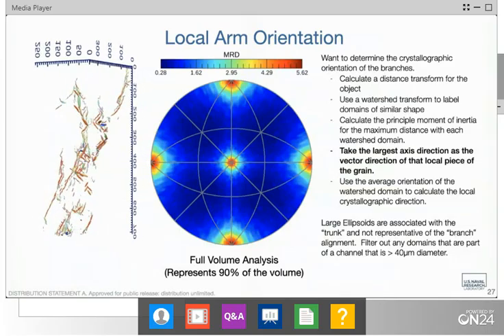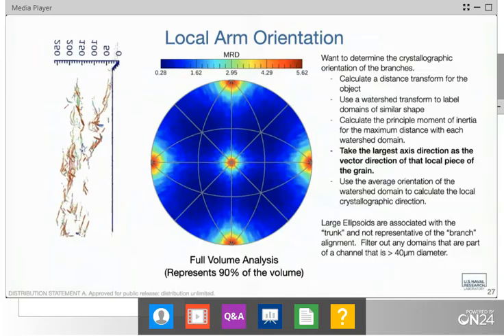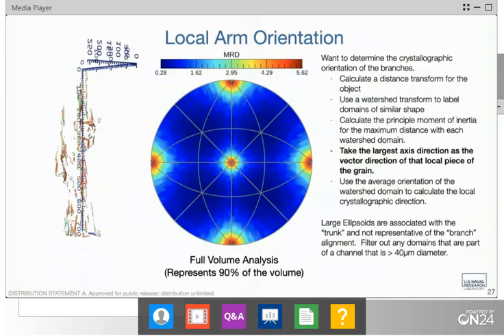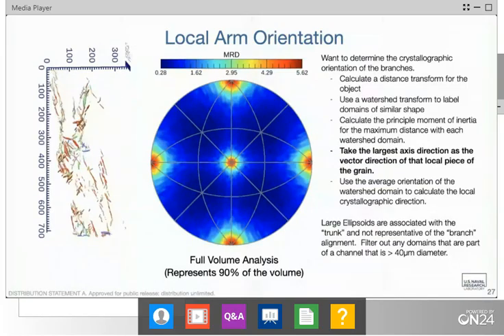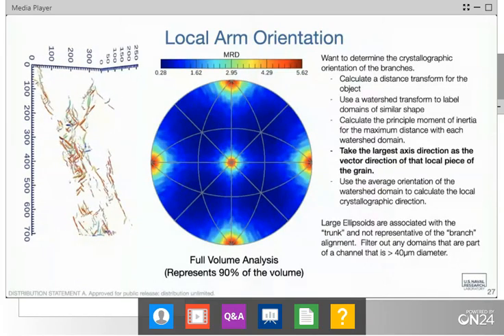So in the case of our 3D reconstruction here, we were putting in fiducial marks and we would have to replace those approximately every 10 times. That was very advantageous from the standpoint of that's about how many we could do in one day.